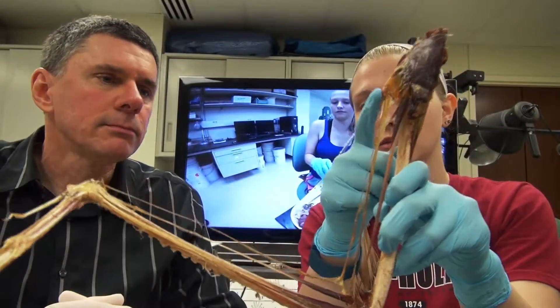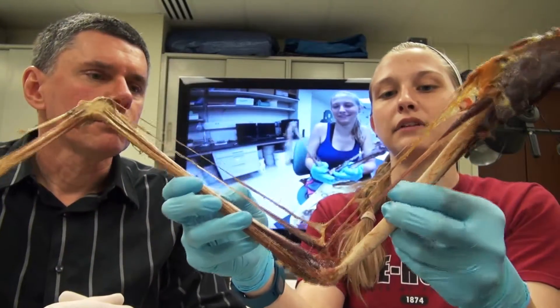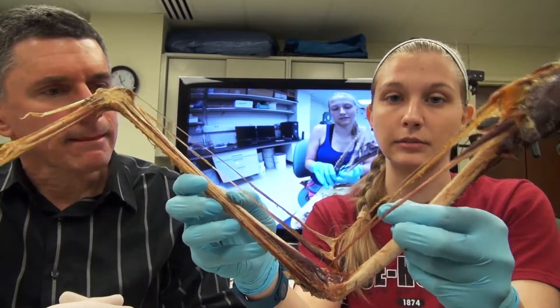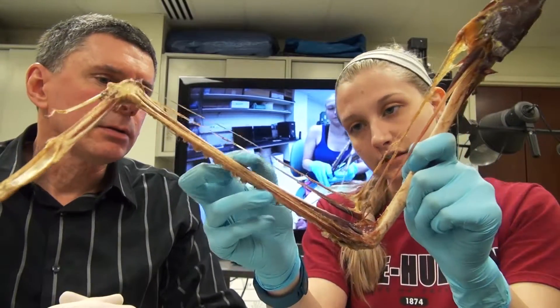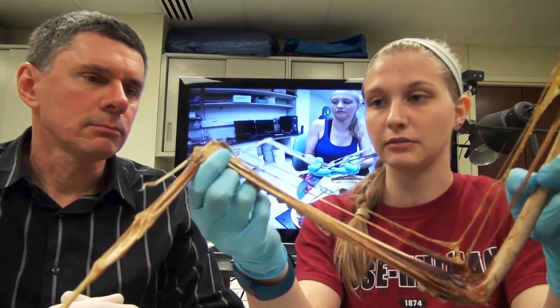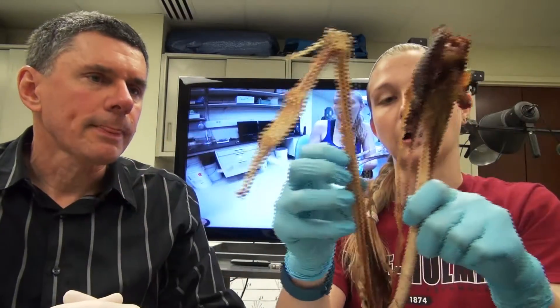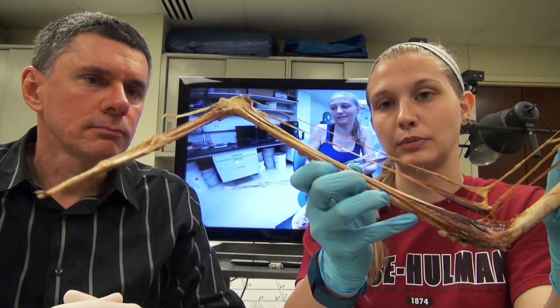You have the propatagial ligament which starts all the way up here in the shoulder and actually extends all the way down into the wrist. And then you have the limitans cubital ligament, which is just the limiting ligament of the elbow that helps keep it from hyperextending. And then you have these little guys down here which are the extensor carpi radialis, which also go up into the wrist and attach there like the propatagial ligament. The fact that these two guys actually attach into the wrist means that when the arm is straightened they pull back on the wrist and help it to extend.